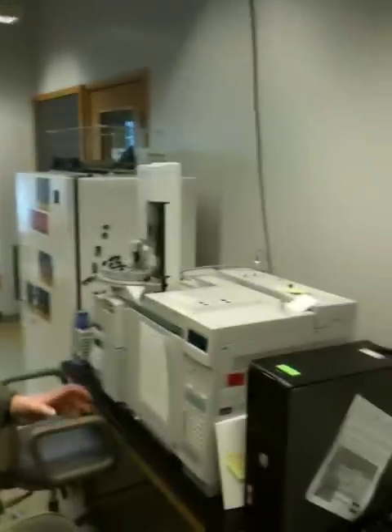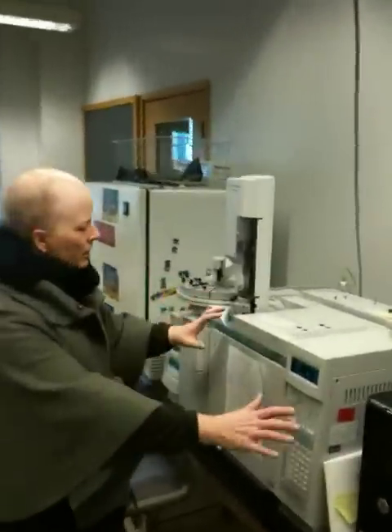This is Dr. Mary Storms up in one of the research labs. I just want to briefly show you the GC mass spec, which stands for gas chromatograph mass spectrometer, that you'll be using in the course of the semester. You probably won't get your hands on this instrument right here, but I want you to have a little bit of familiarity with it.